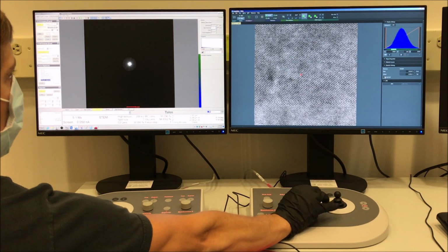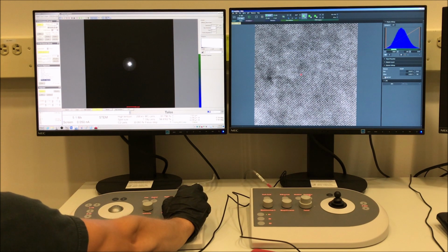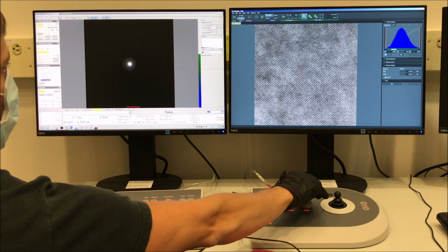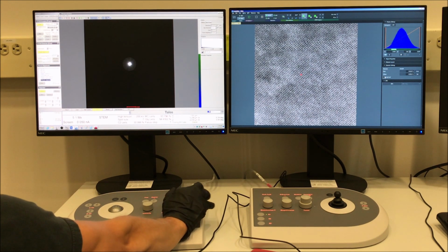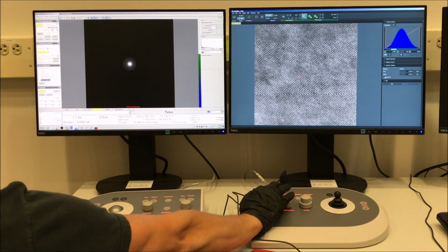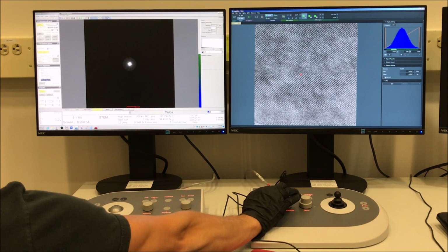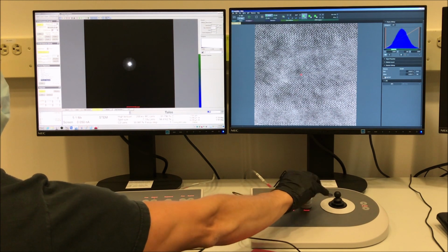where the stigmator adjustment is closer to where it should be, and you're going to see how this should look once I have it dialed in perfectly. Again, you can see clearly I have streaking that goes diagonally here, changes from going over to under focus. One other thing to point out too is that you have to be sure that you are on zone axis, or else you might be seeing the streaking just by virtue of not being properly aligned with the zone axis.